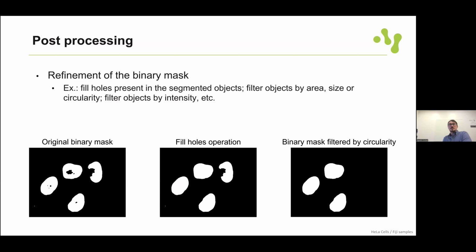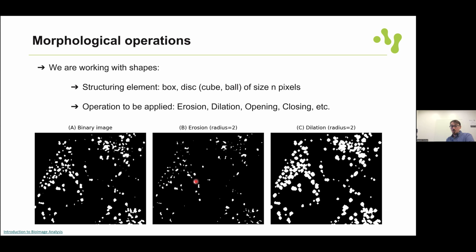The easy way of showing them is, let's say you have the original image and you apply an erosion. You can subtract one image from the other, and then you get the outlines, and that's the actual change you made to your image.